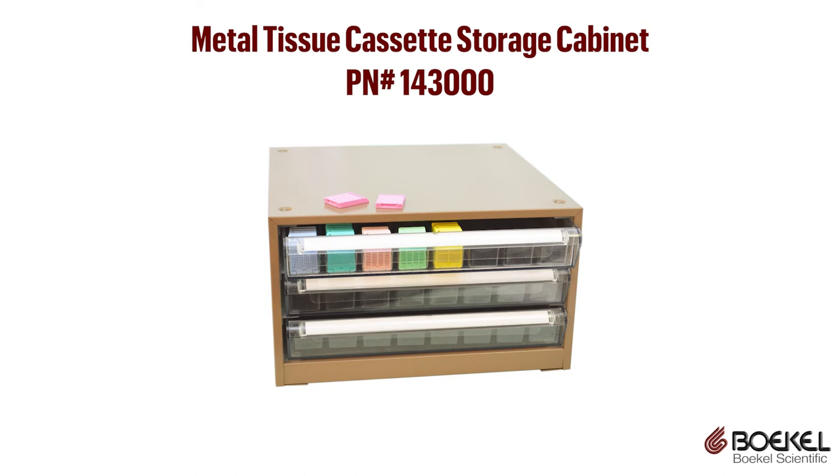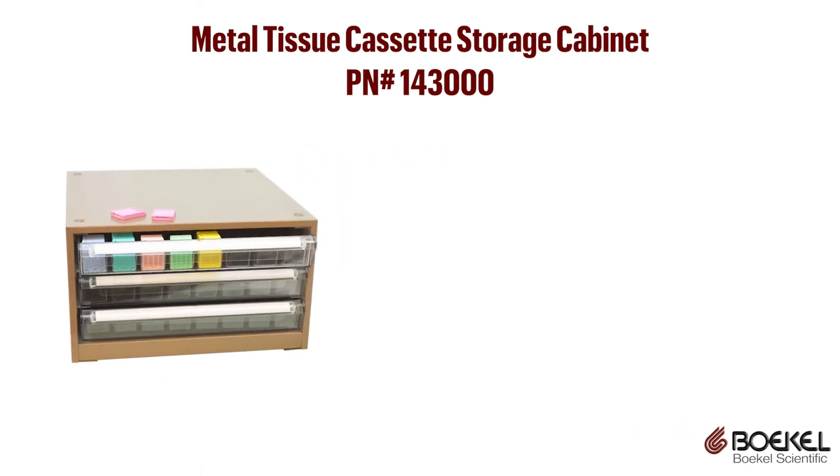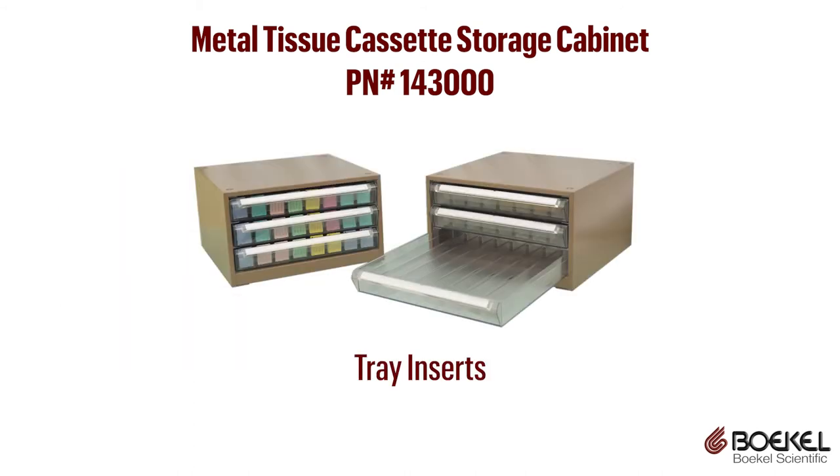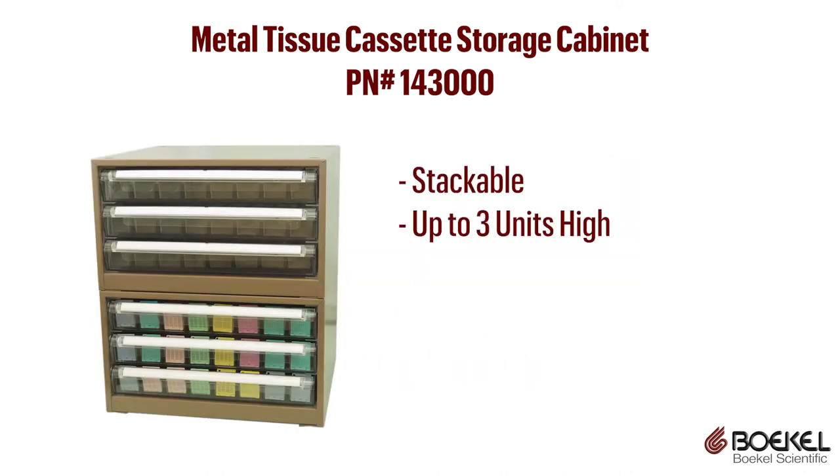Bocal Scientific offers metal tissue cassette storage cabinets with heavy-duty plastic drawers. Store up to 1,200 paraffin-embedded tissue samples in three clear drawers. The unit has tray inserts for organizing drawers and customizable labels for easy identification of samples. The cabinets are stackable up to three units high.